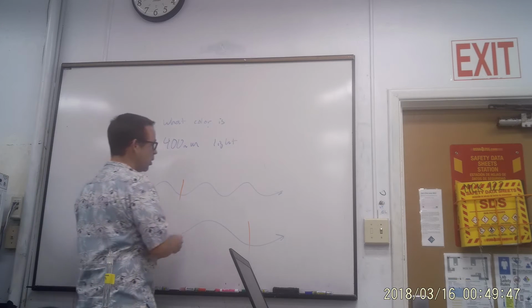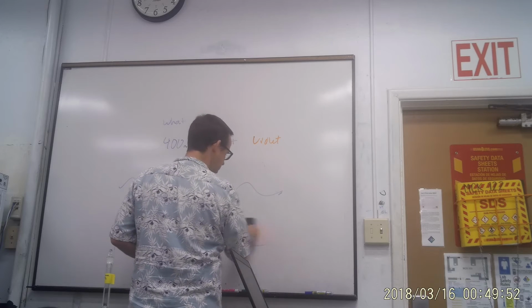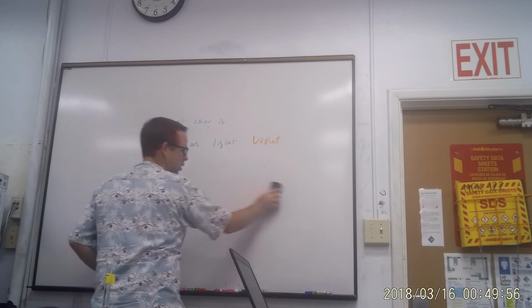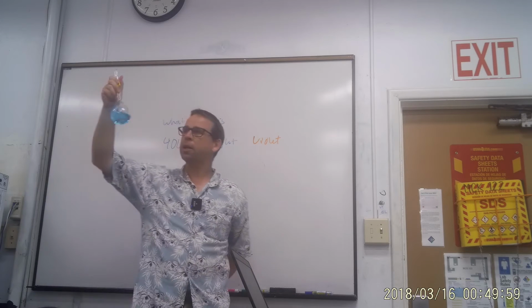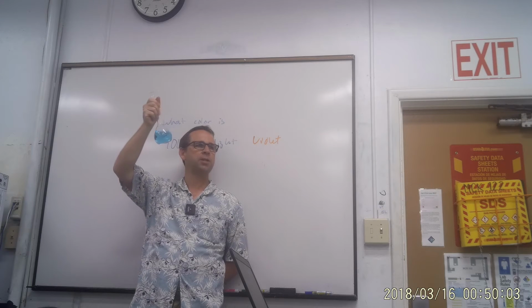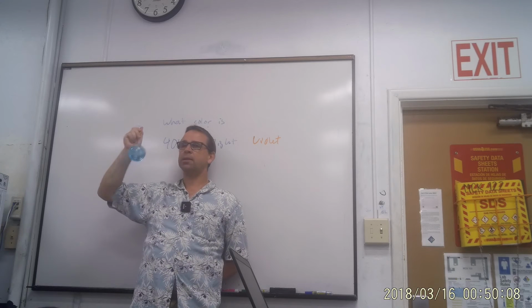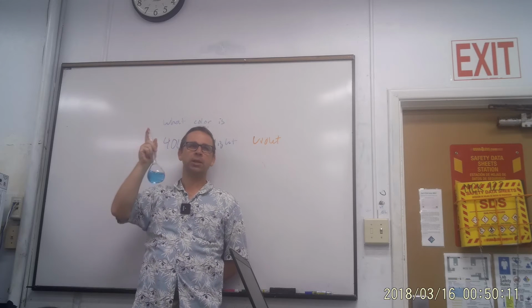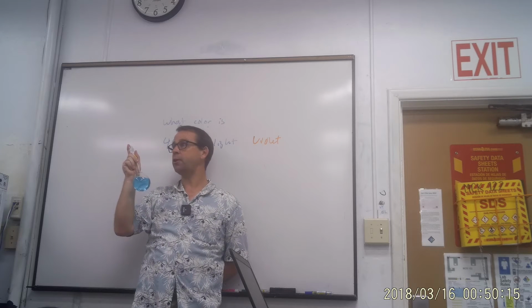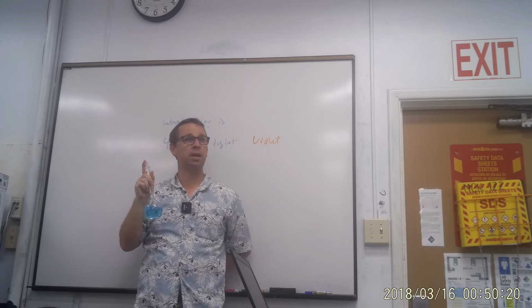So, what color is 400 nanometer light? Violet. Purple. 700 nanometer, therefore, is what? Red. Okay, so we have a material here that is absorbing what color wavelength then, or what wavelength of electromagnetic energy? 700. Around the 700 range. I can tell it's not absorbing, a little bit past, maybe in the 500 nanometer range, because I can see the blue.